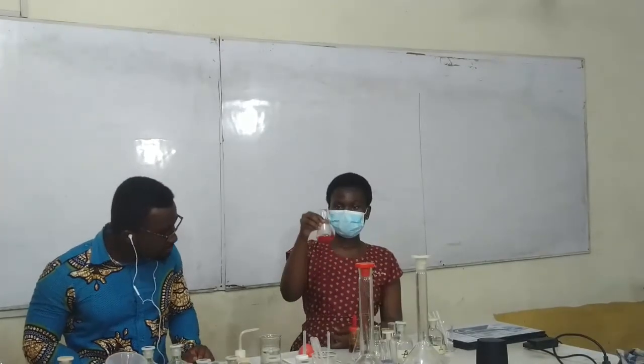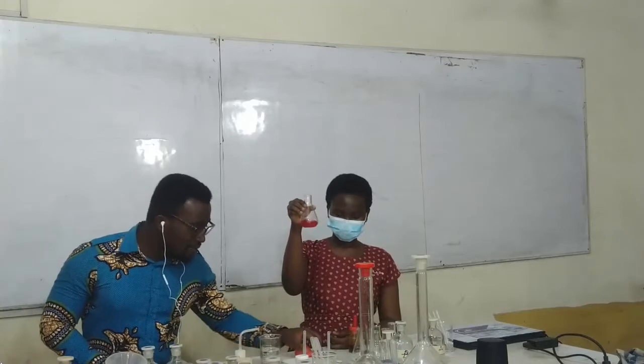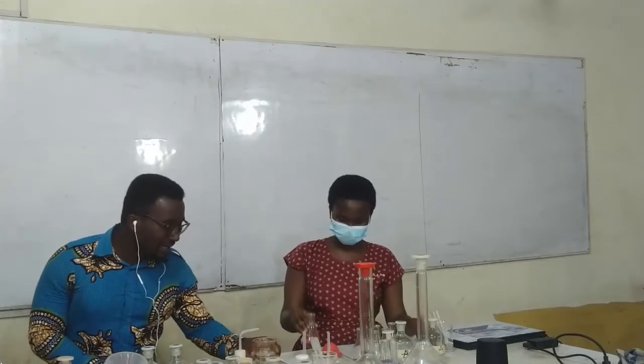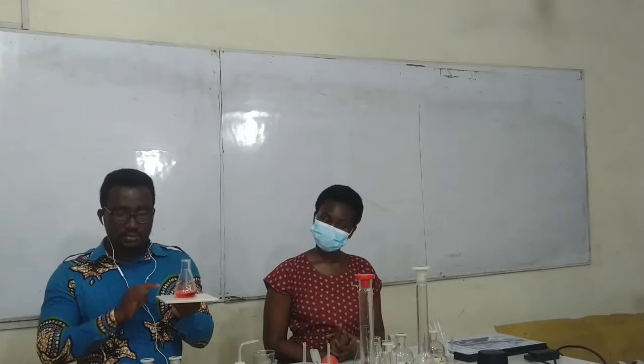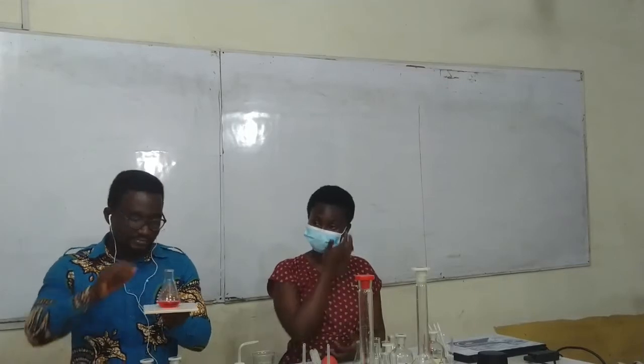Nicely. So we can place it on the white tile, so that you can describe the color very well. So on the white tile, we can describe the color very well. You can pause the video and then guess what color this is. If your guess is that the color of methyl orange over here is red, then your guess is right. You are correct. You will explain the theory behind this color later.